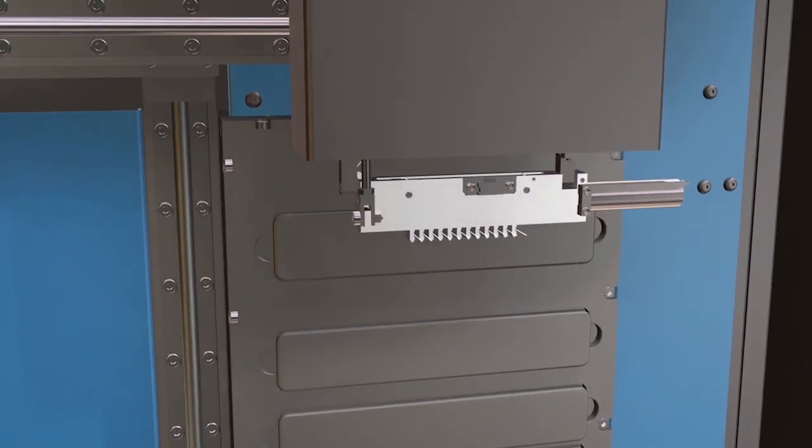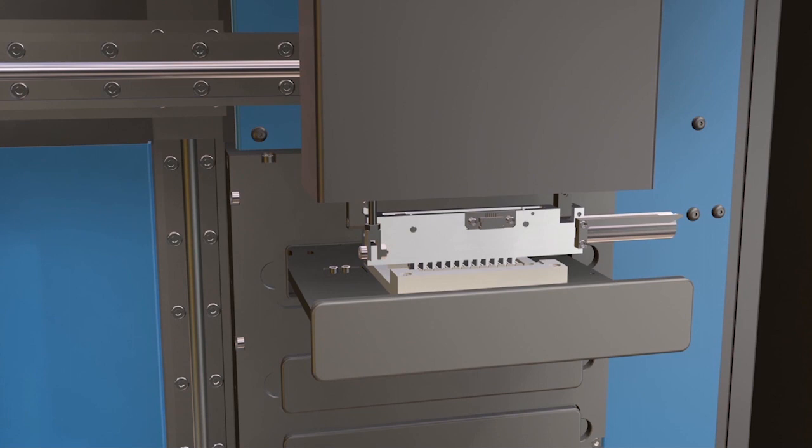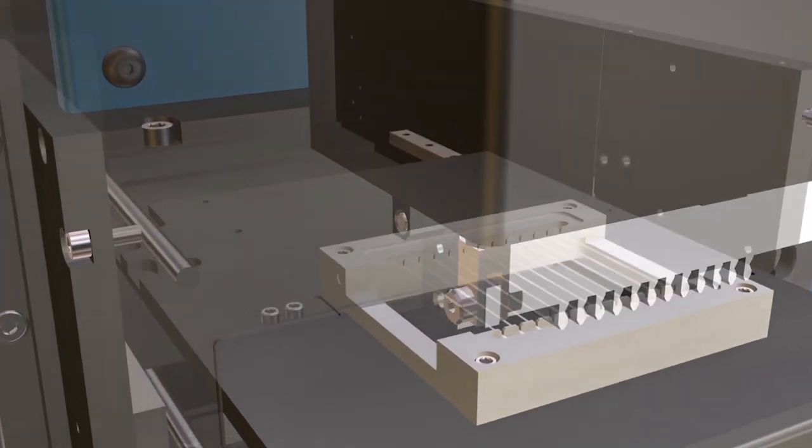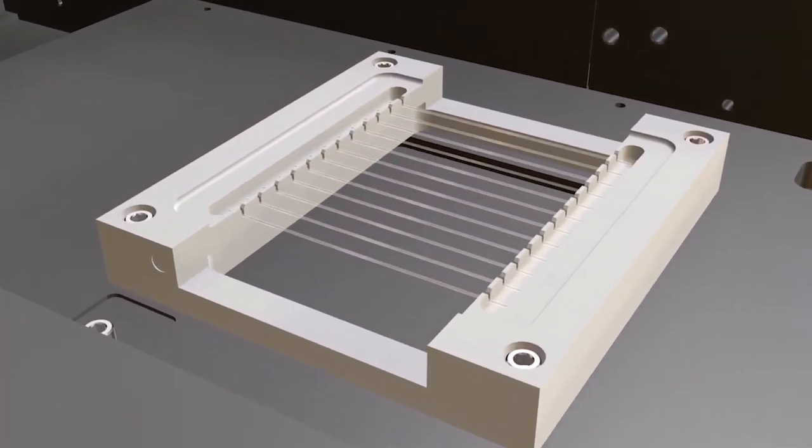The capillaries are placed into the separation tray where a voltage is applied across each capillary to enable separation by molecular weight.